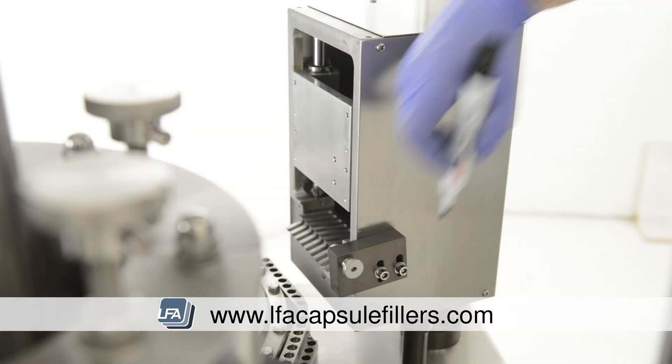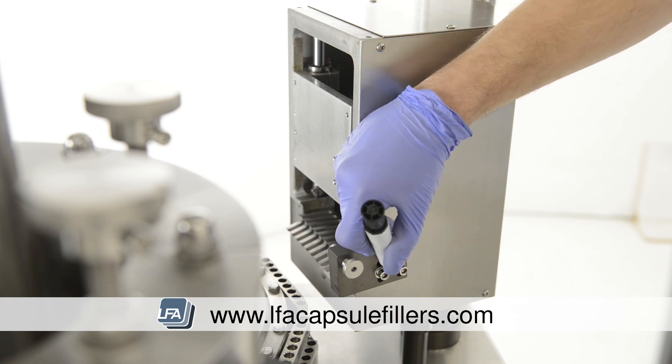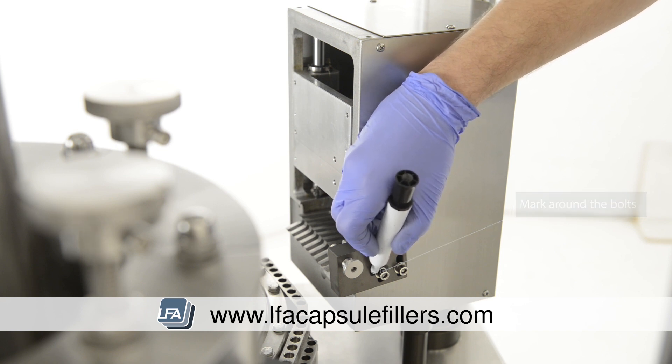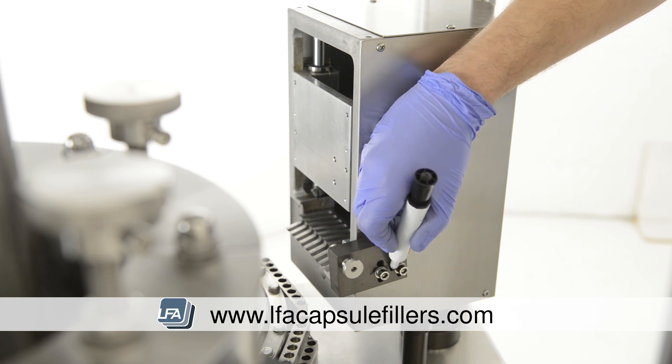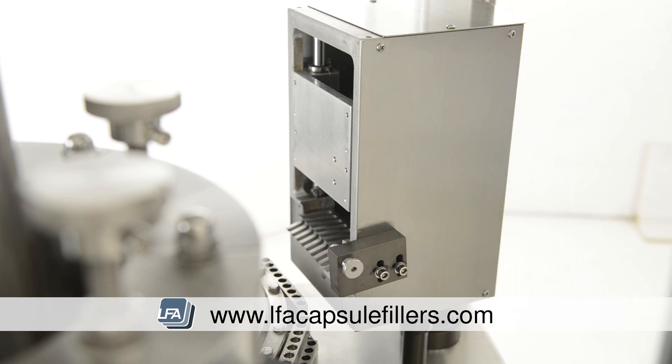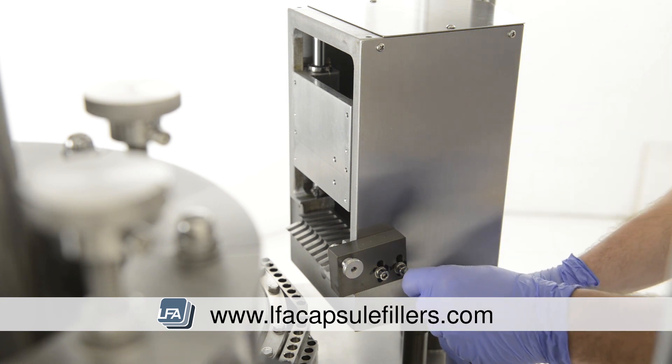We're going to remove the capsule release pin, which turns the capsules on and off. We suggest marking around the bolts to record their position, as the position of this piece is very important to make sure the capsules drop on time. Once this has been done, remove the two bolts with your 5mm allen key — this will release the whole piece.